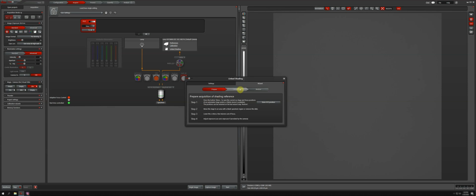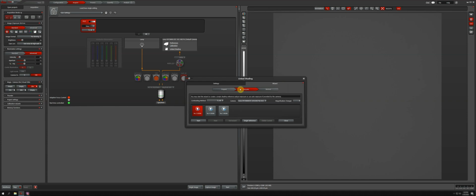I'm now clicking on the Acquire tab. Once in here, you get an overview of the components that are currently being used. As one example, you can then see the three different objectives down here. You can see what kind of contrast method you're using. So right now, transmitted light bright field. Here you could also select other contrasting techniques. If your system has a magnification changer, that one will also be highlighted over here.